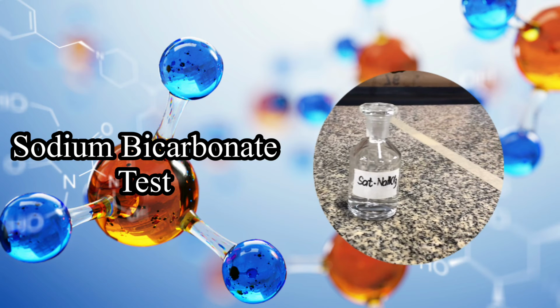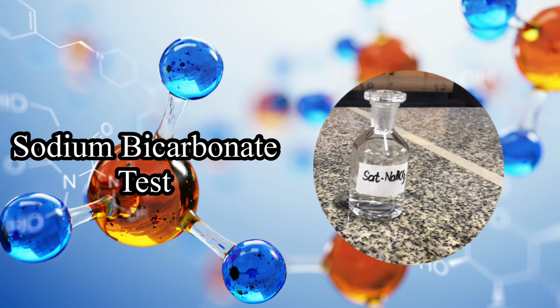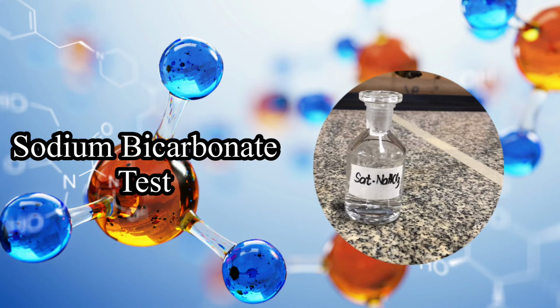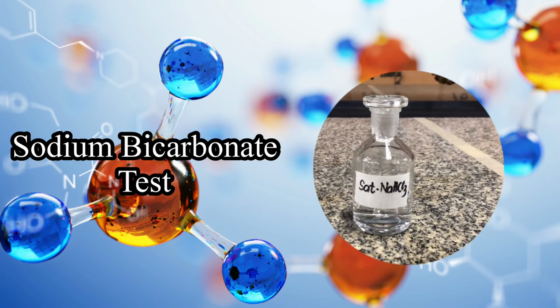The final procedure for this experiment will be the sodium bicarbonate test, which utilizes saturated sodium bicarbonate solution. The acidic group of carboxylic acid will react with bicarbonate ions, producing carbon dioxide, and is seen as the formation of effervescence.